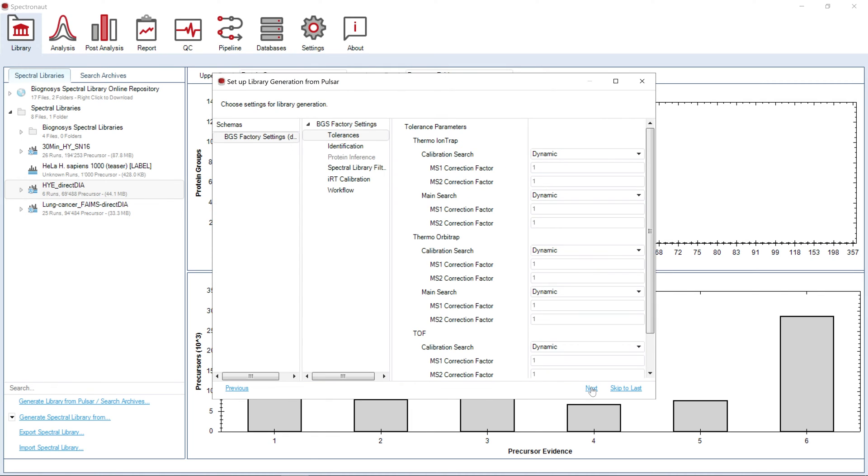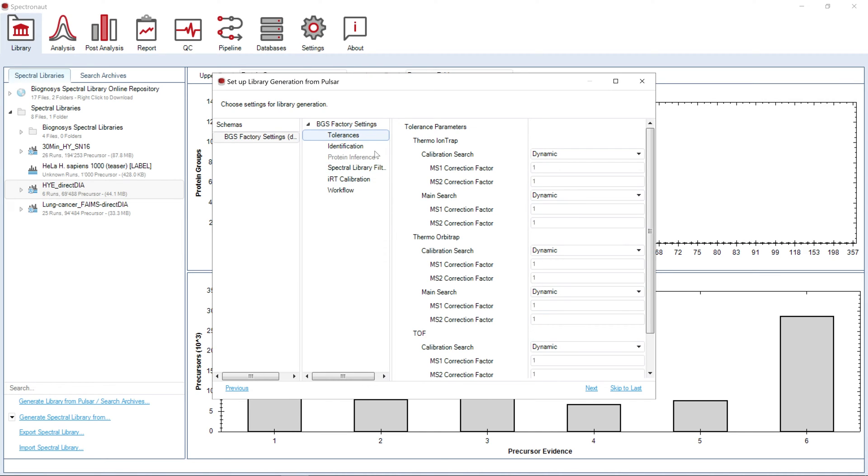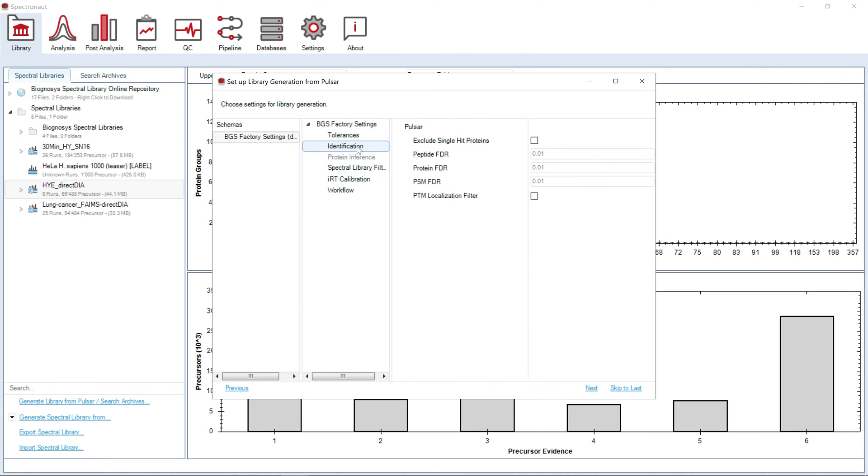The next wizard page contains experiment-wide settings for library generation. For convenience, you can use a settings schema predefined in the settings perspective. Alternatively, you can modify them while setting up the search. Here you can find settings related to MS1 and MS2 tolerances, identification thresholds including PTM localization filter.